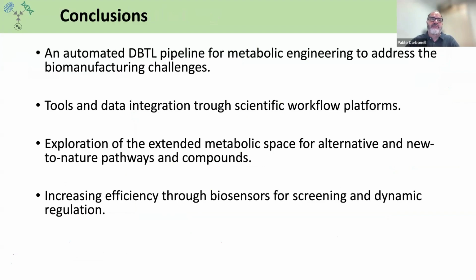So just to conclude, here I showed you a DBTL pipeline for metabolic engineering to address the biomanufacturing challenges. And as you have seen, there are multiple tools and data sources that can be integrated through our scientific workflow platforms.